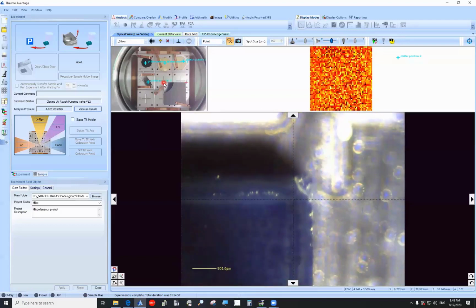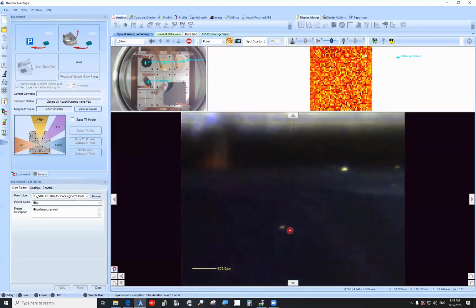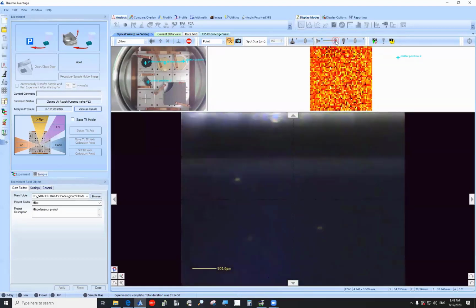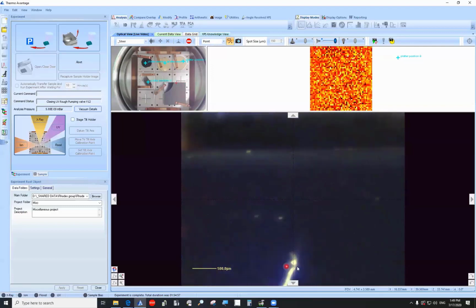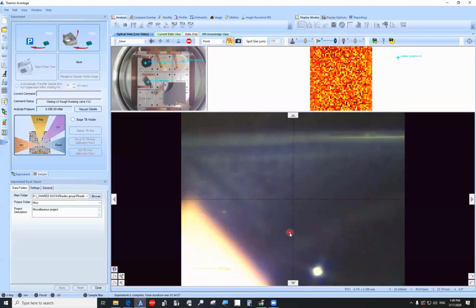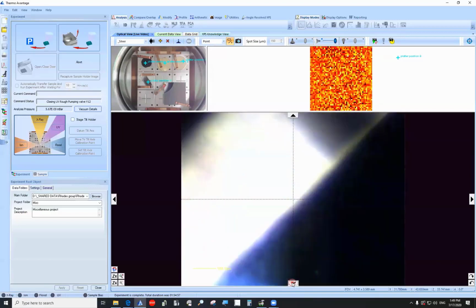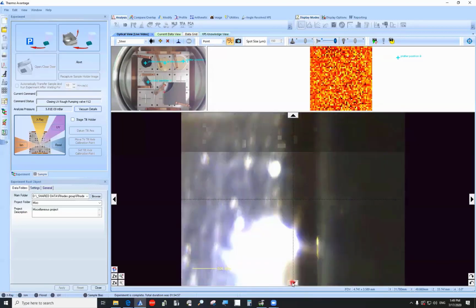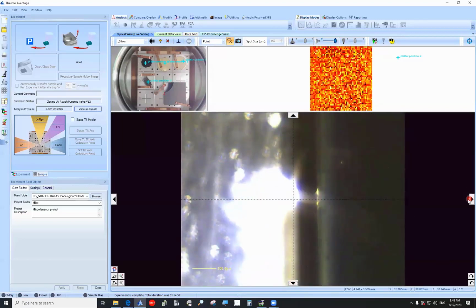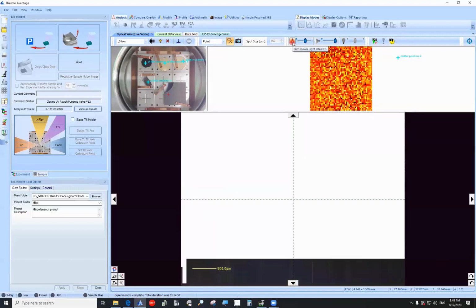Again, I can drive over here by clicking on the platter view, and we can just see if there's an obvious change in the contrast as we get over here. So it looks like a delaminated side. So that was the interface. There's the metal clip. Yeah, I'm not sure exactly what's going on right there. Down here, there's another interface right about there, where something has happened between these two positions.